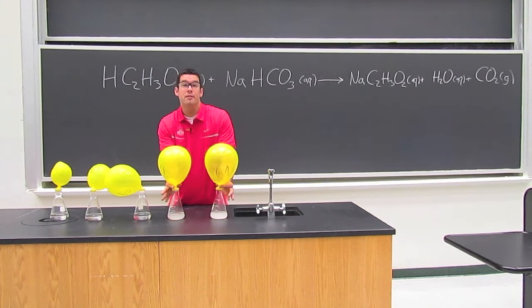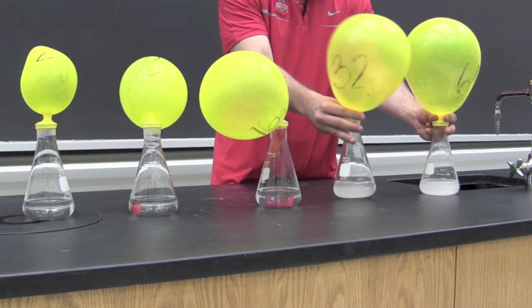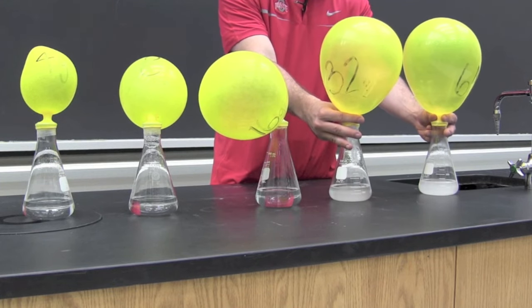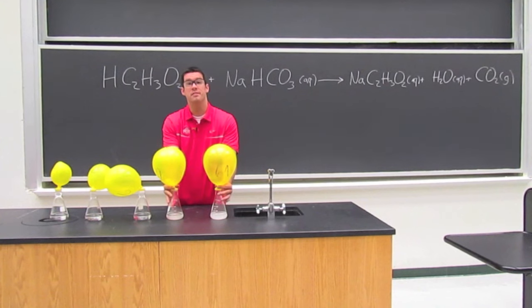So after this reaction has completed here, we can see that the relative size of the balloon for the 32 and 64 grams sodium bicarbonate is roughly the same.